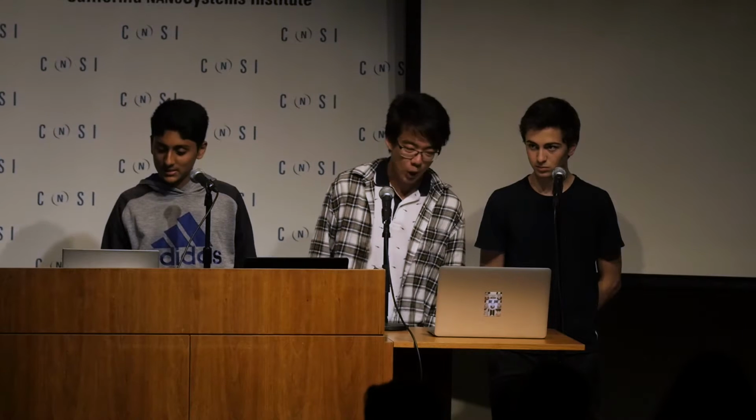And for atomic force microscopy, we could analyze the repulsions from the electron cloud in atoms on the surface of the sample by using a thin tip probe, which is made up of about one atom, and monitoring a cantilever. We'll attach a CD25 plus T regulatory cell to a tether attached to a probe and measure the affinity between that cell and the cytotoxic T cells. And finally, for confocal microscopy, we'll produce a 3D image of T cell interactions.